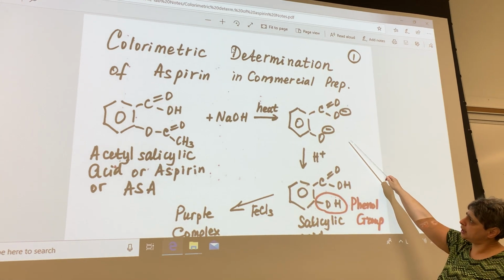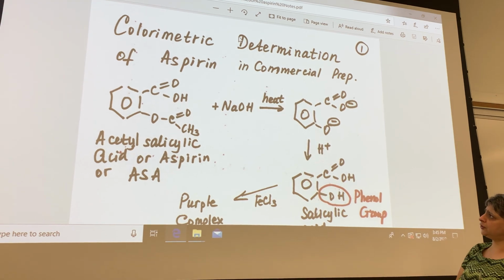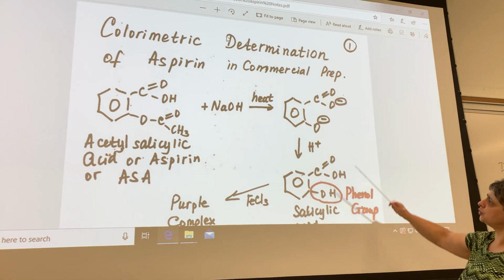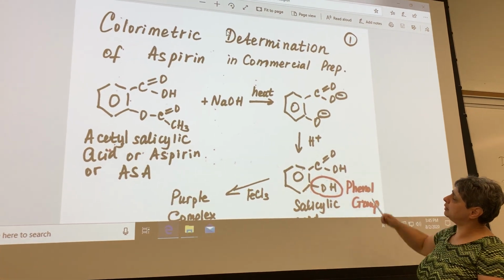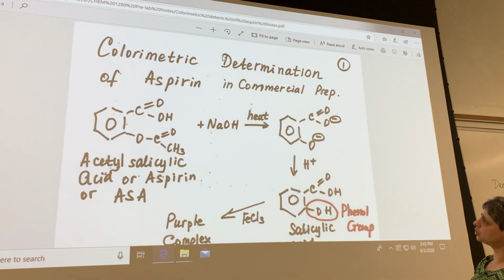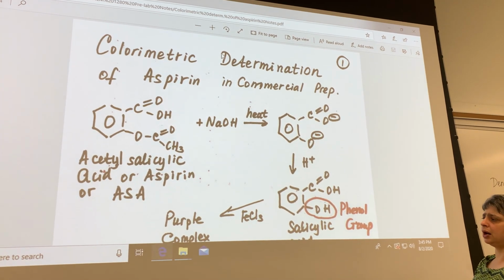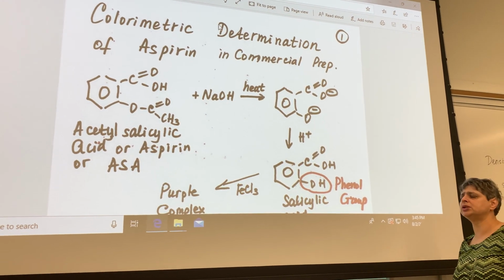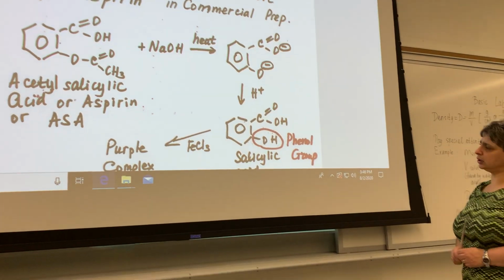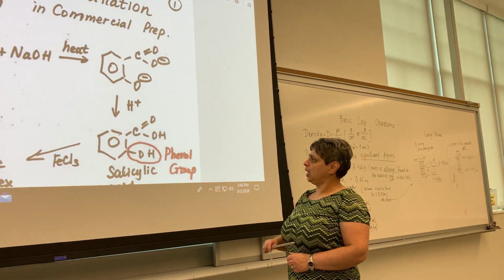After you heat, you're going to transfer the solution into a large 1 liter volumetric flask, and first you're going to add water and simply dilute it to create 1 liter of your stock solution. And then once that's done, you're going to prepare a series of standards, but you need to introduce a color-forming reagent in order to allow the solution to gain color so that it would absorb light and provide you with meaningful absorbance readings.